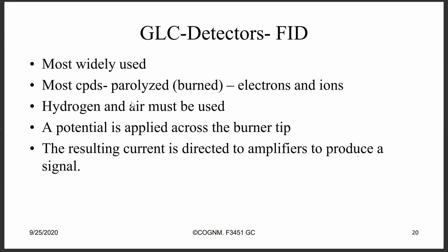Remember, you guys know these things. So because of the ions produced by the analytes, then we have currents, and then the current is amplified, and then eventually we have a signal. Then this amount of analyte gives this amplified response, this signal, and that tells us how much of the sample is present.